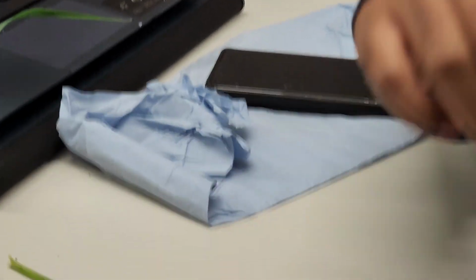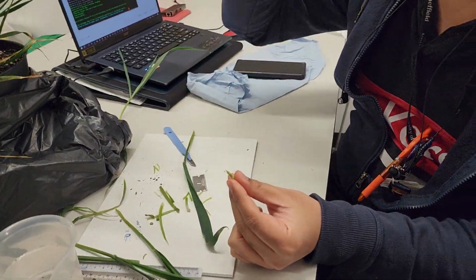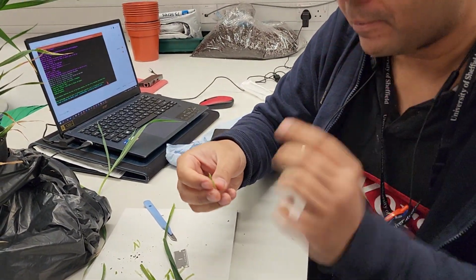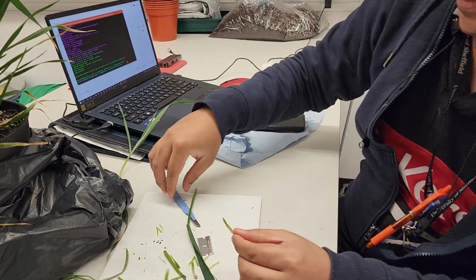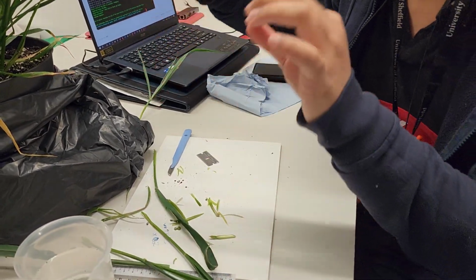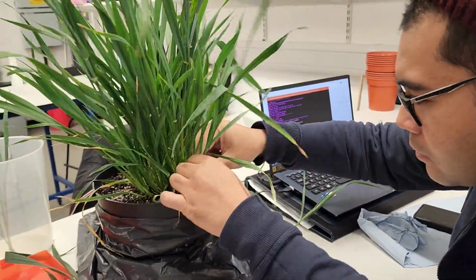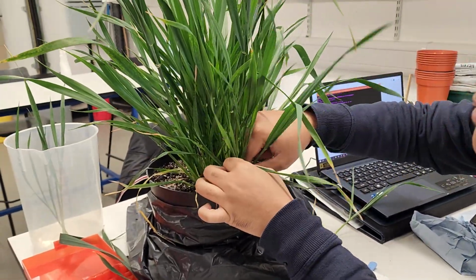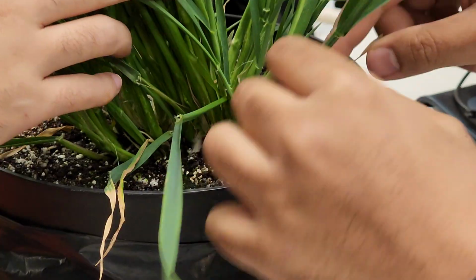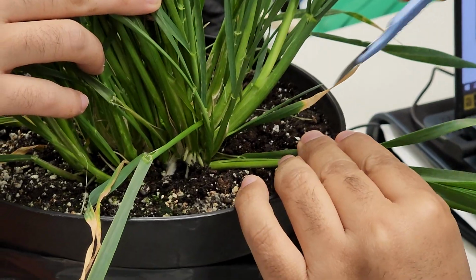Yeah. So meaning that we cannot use this type for our sample. We need to use the one that I just used without stem elongation. Right. Who wants to do it? Better not, because you need a bit of skill to do this. So let's find the one without stem elongation. Yeah, you can feel it. There's no bumpy surface. Smooth. This one might not be good, so let's get this one. There.